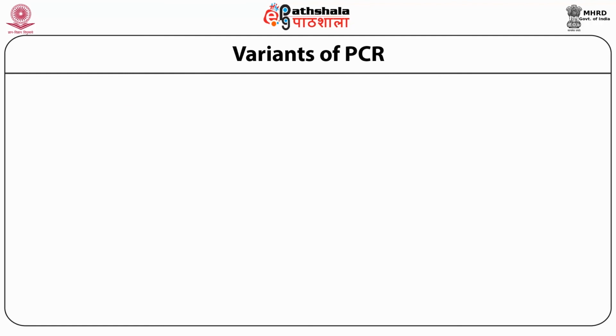PCR reactions are modified to give them wider applicability for different applications. For that purpose, a number of variants are now available which help in particular specific applications.